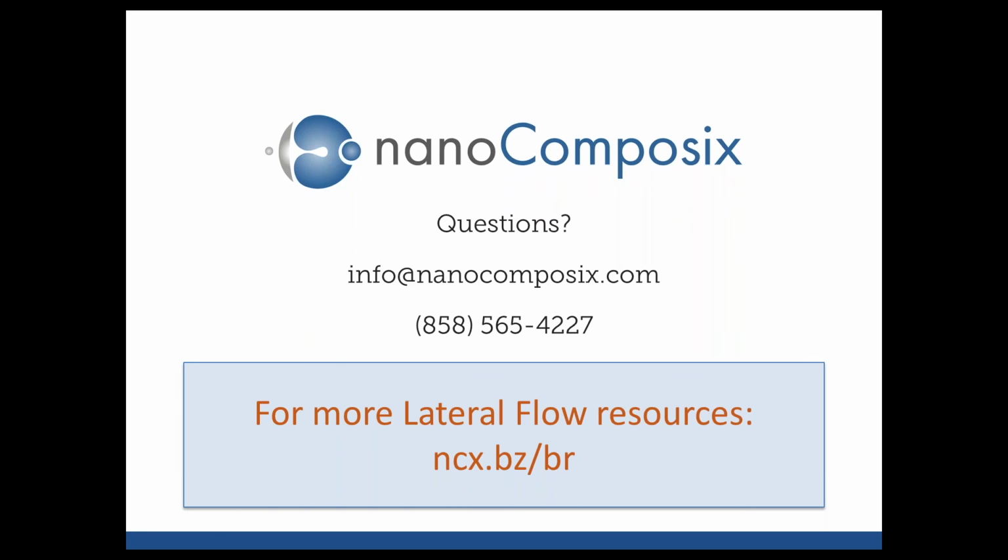So there's a whole bunch of different probes in terms of fluorescent beads and dyed beads and upconverting phosphors that are all potential candidates. And in some cases, those have even higher sensitivities. One of the drawbacks is that you typically need a particular reader that's going to be coupled with that. So if you're looking for ultimate in sensitivity, there are other options. It's just that you're going to have a requirement of having a more complicated reader, which works fine for the lab, but in some of these more mobile or far forward applications where you want to use it from a consumer perspective, it's more convenient just to be able to look at it and see contrast.